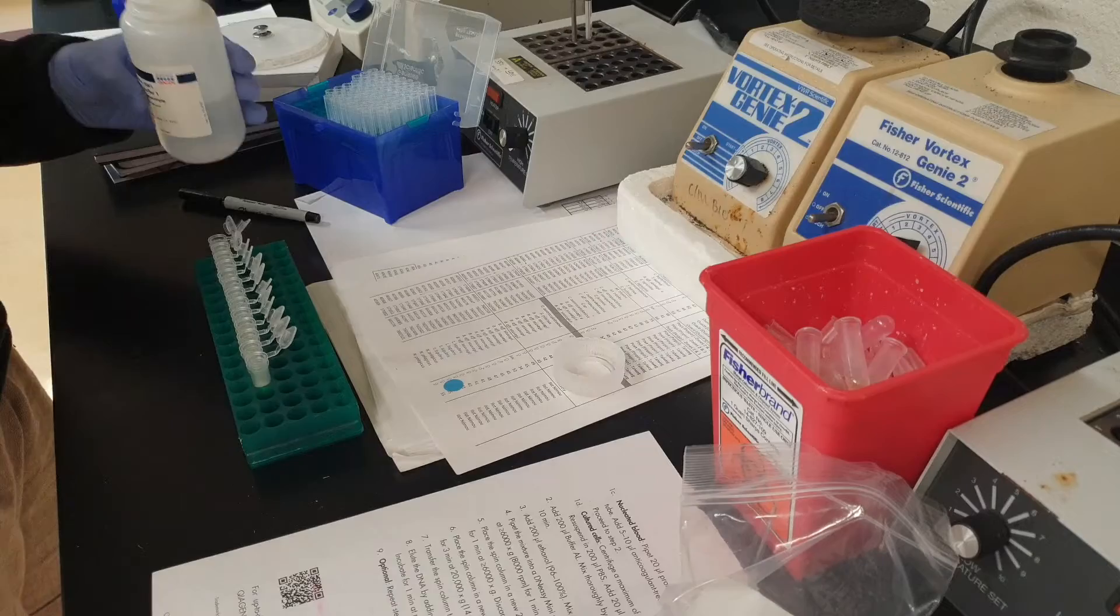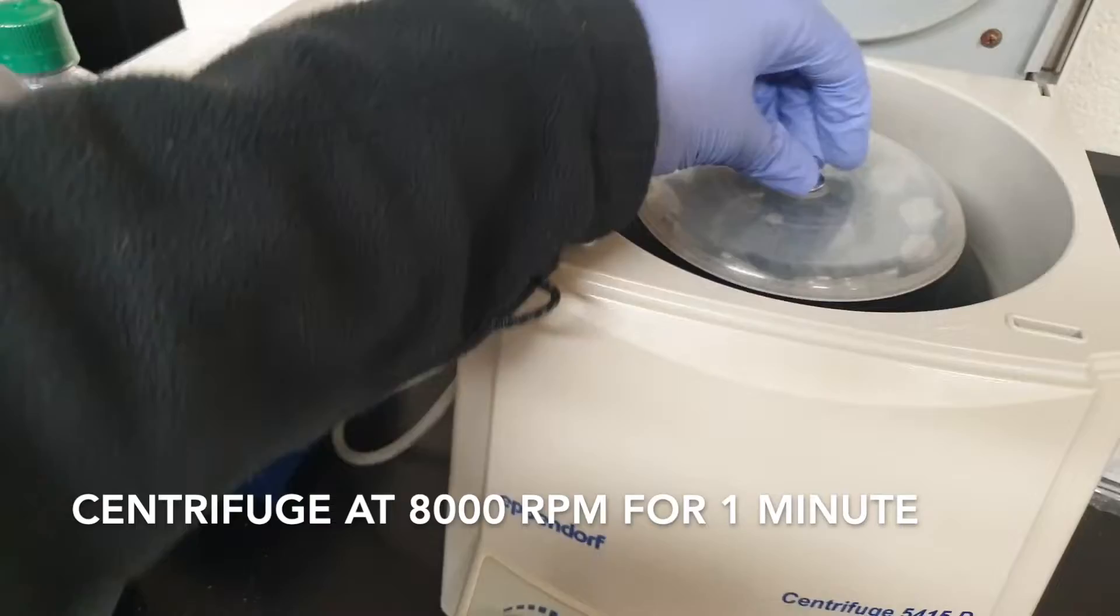Add 500 microliters of buffer AW1. Centrifuge at 8000 rpm for about a minute.